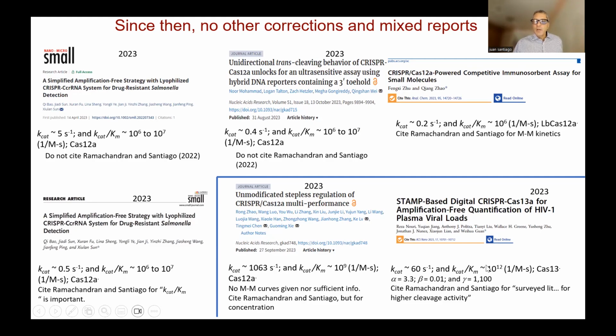And here, a rare paper where they publish enough data so that we can calculate the alpha, beta, and gamma values. We see that these values, especially gamma, are way off, and the kinetic rates are also grossly inconsistent.